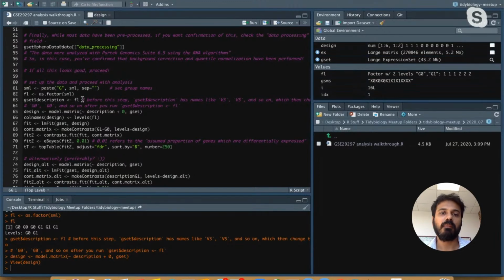So limma just does a simple t-test comparing beta 0 plus beta 1, which is the mean expression in group 1, versus beta 0, which is the mean expression in group 0. It's probably best to actually see this all written out, so I recommend looking at the documentation for the limma package itself. It explains it really nicely.